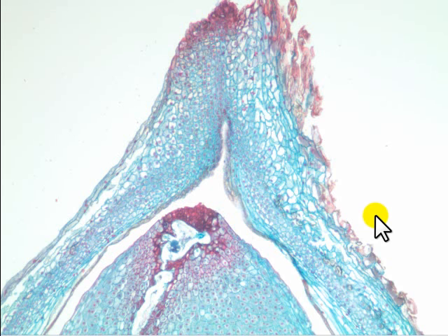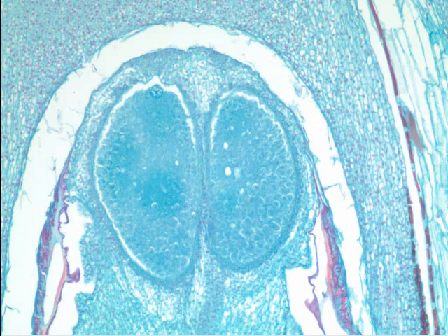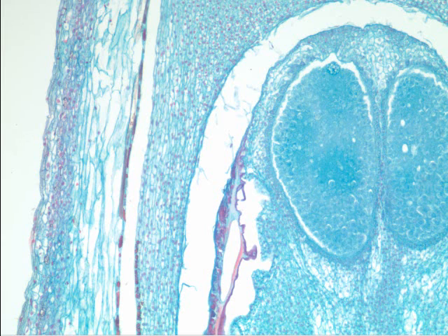This is from your slide collection. We're right up here. The micropyle will be up this way someplace. And as we proceed on southward, this is still part of the original ovule tissue. This is all what chromosome number up here? 2N. As we go southward, though, we now come to, what would this be called? And not just these structures here, but this entire entity in here. This is the, excuse me, the female gametophyte. And what are these structures right here? Archegonia. Yes, they are. 2 archegonia there in the female gametophyte.